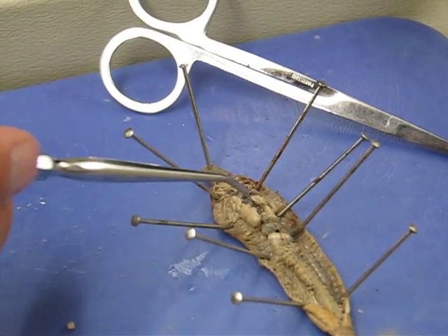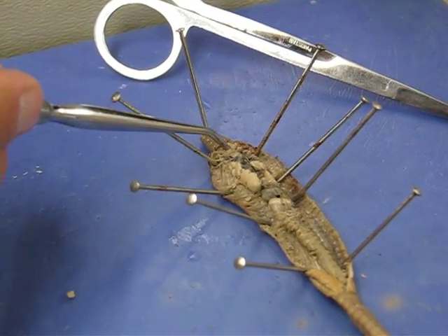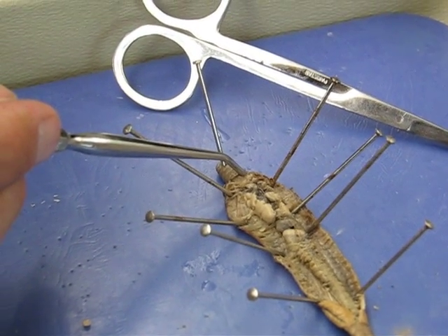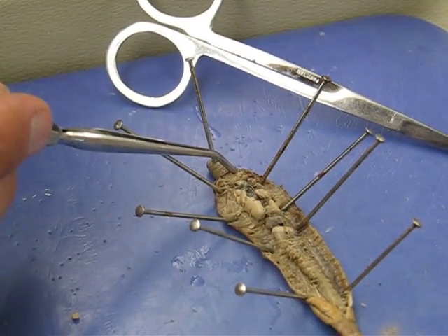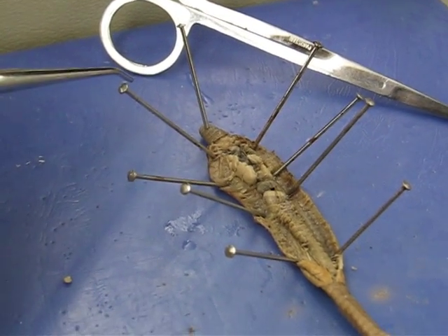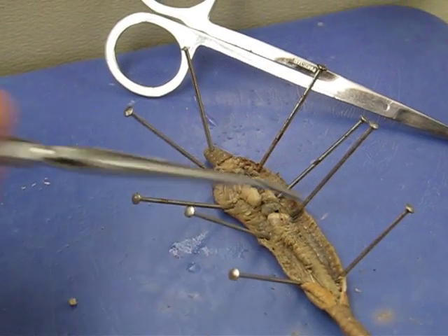Those little black structures there. This is what they call the central ganglia — or cerebral ganglia — which is basically the equivalent of the brain. Let's see what else.